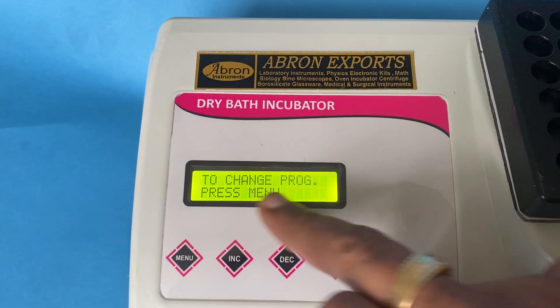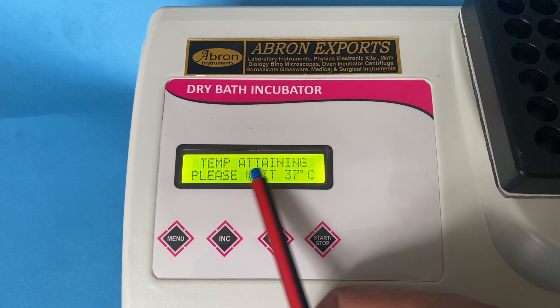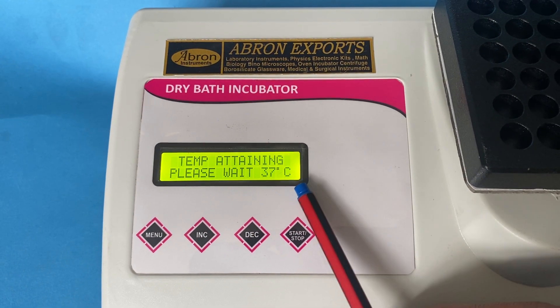To start the process, just press. I just push — it says press to attain temperature. 37 degrees is already there.